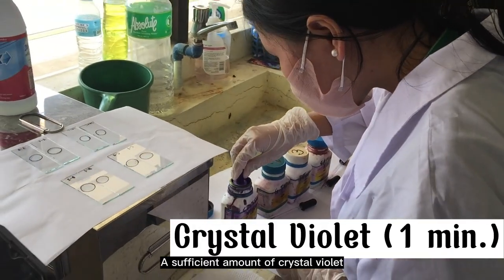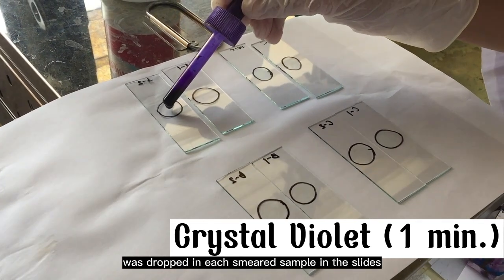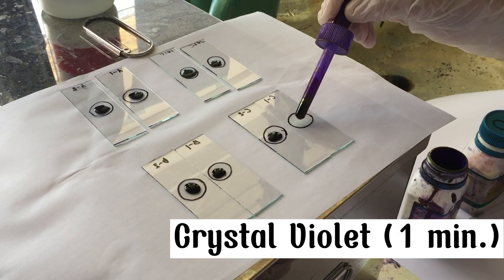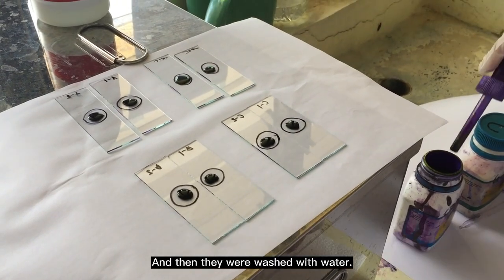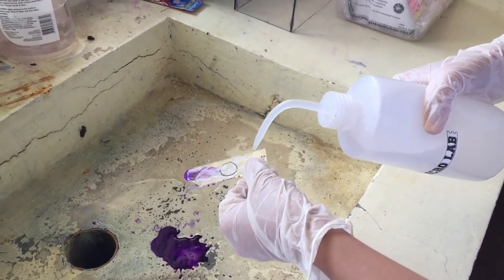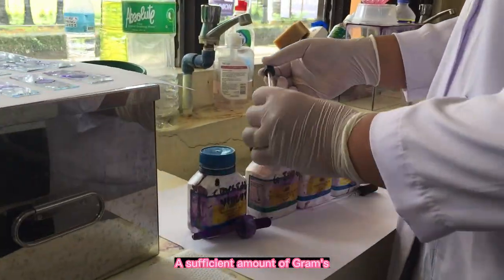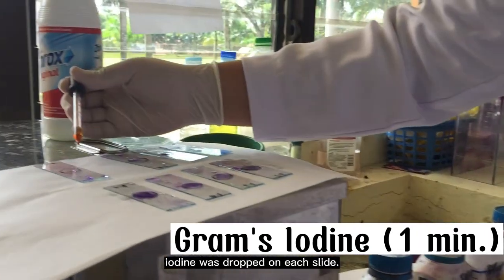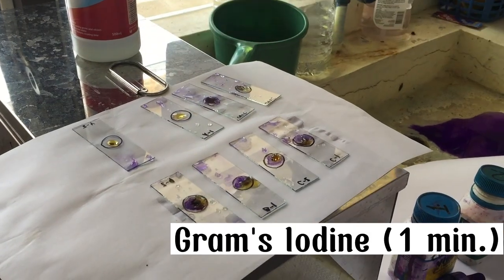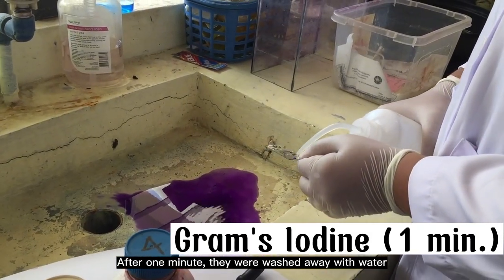A sufficient amount of crystal violet was dropped on each smeared sample in the slides, ensuring that all samples are covered for 1 minute, and then they were washed with water. A sufficient amount of Gram's iodine was dropped onto each slide. After 1 minute, they were washed away with water.